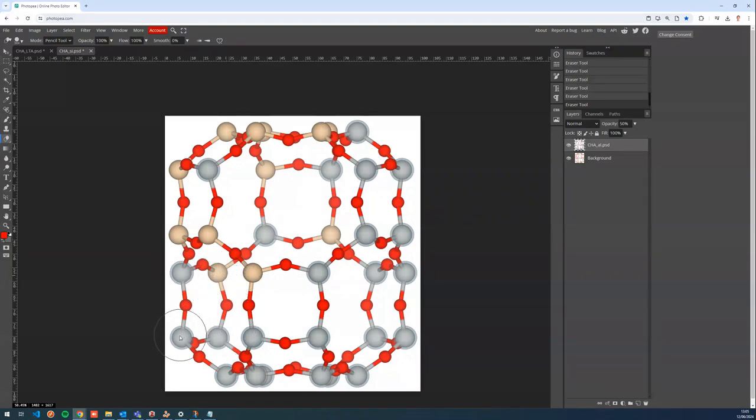Let's take a bit more. Of course, you also have to think about whether aluminiums can be in close proximity or not. This is something that you have to check and validate. But again, I would rather use this only for visualization purposes, not to highlight crystallographic units or effects. But okay, let's keep on going.